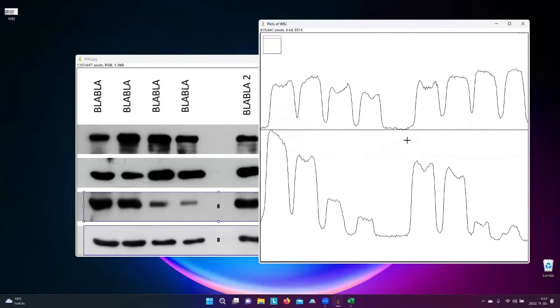I think now it's more easy to select the baseline because then it should cut all these curves. So in my case, I'm going to set the baseline, which should be set like this. And also I'm going to do the same thing on the lower part, but this lower part was the second of mine.